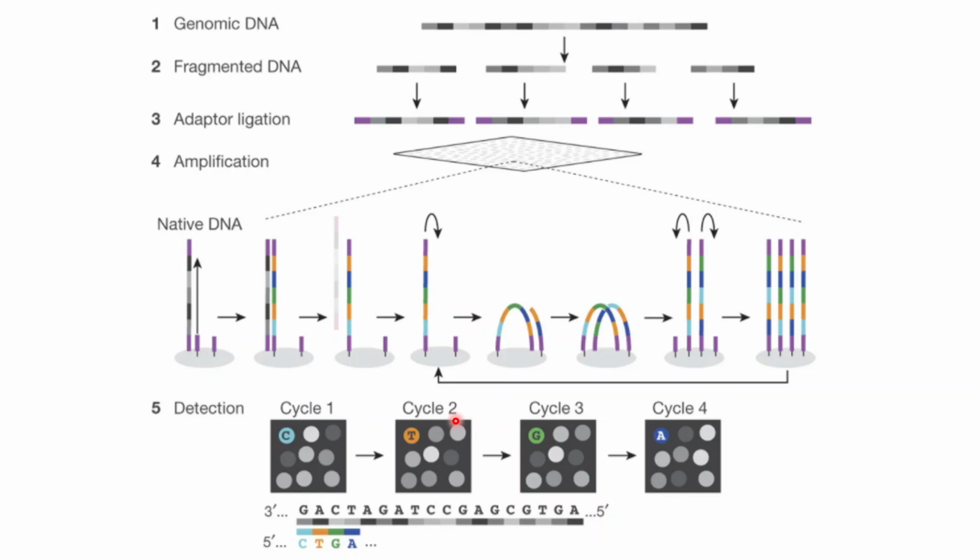Also, the processivity of the polymerase decreases with the length of the insert size. If the insert size is higher, then the processivity will also decrease, and these kinds of issues pop up in this case. So we need to clear this out.